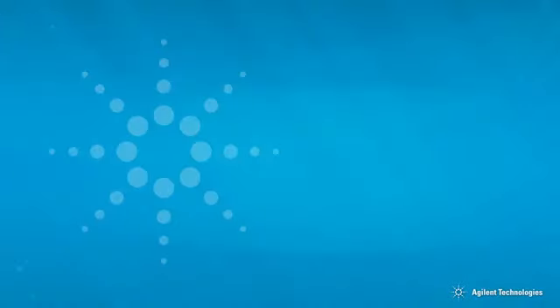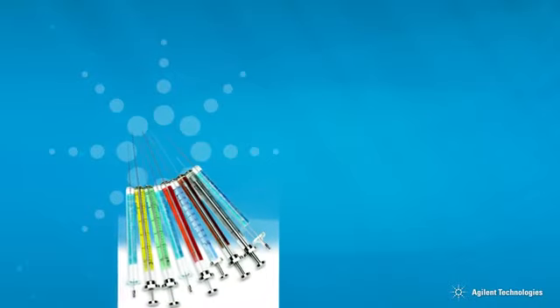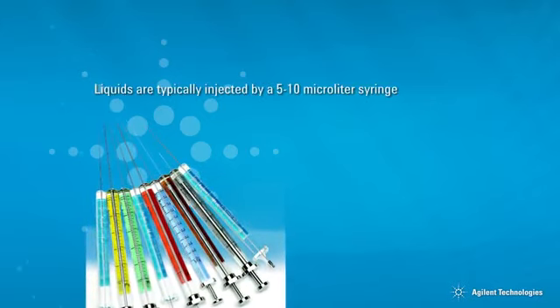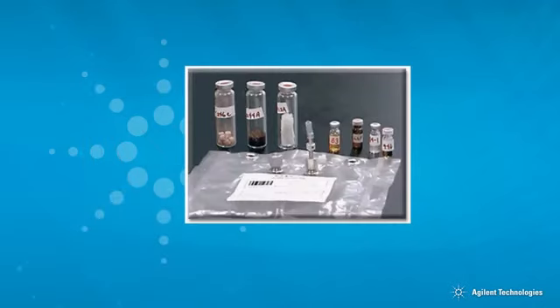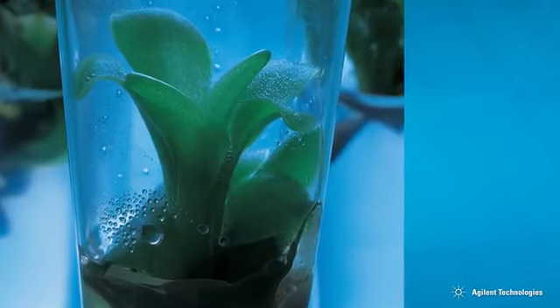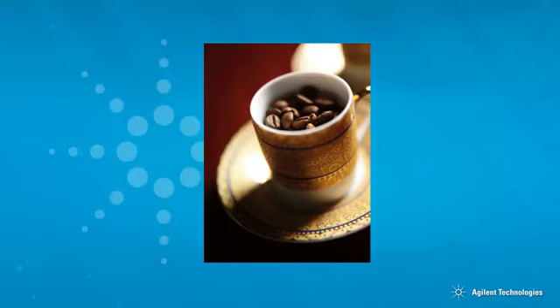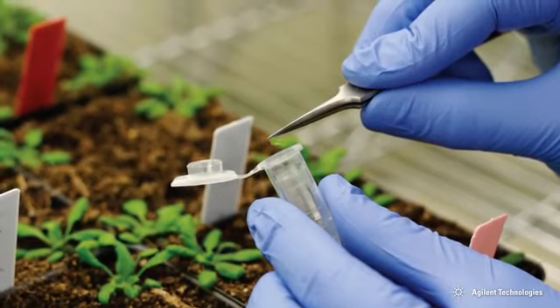Here are some other types of GC samples. Most commonly, liquids are analyzed by injecting them into a heated GC inlet or injection port using a 5 or 10 microliter syringe. Gases can be analyzed using a gas-tight syringe or a gas sampling valve. Solids can be analyzed by extracting chemicals that are in the solid with a liquid solvent. Think of making coffee.